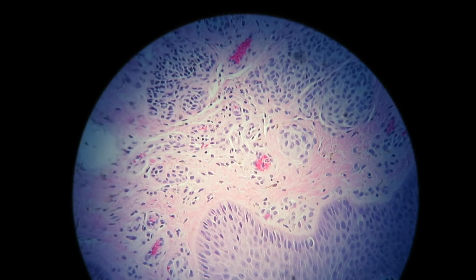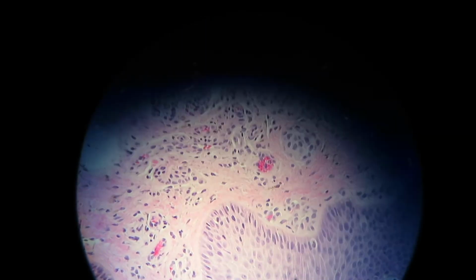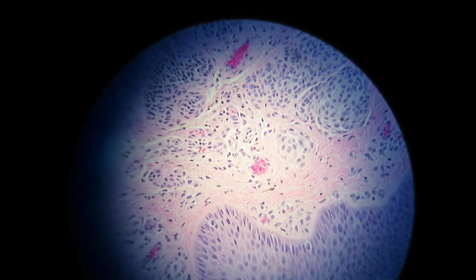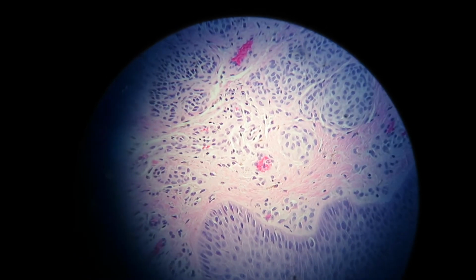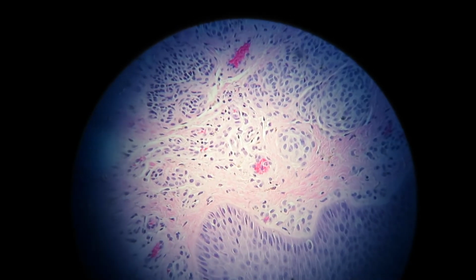and that's how we make this diagnosis. We look at it, and from our training we can recognize patterns and cell types and what we're looking for.